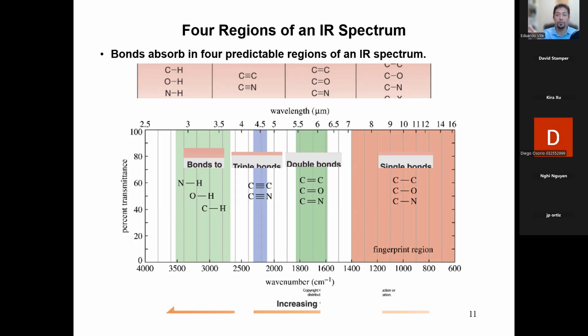We do for some things, like esters are between like 1000 and 1300, but we don't really look at it for the majority of molecules, and by molecules, I mean functional groups, because most of the functional groups have heteronuclear polar bonds. They have different atoms, and they are polar and asymmetric, so they will often just be in the higher numbers.